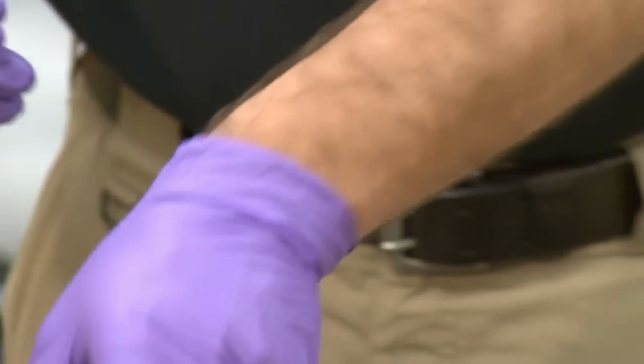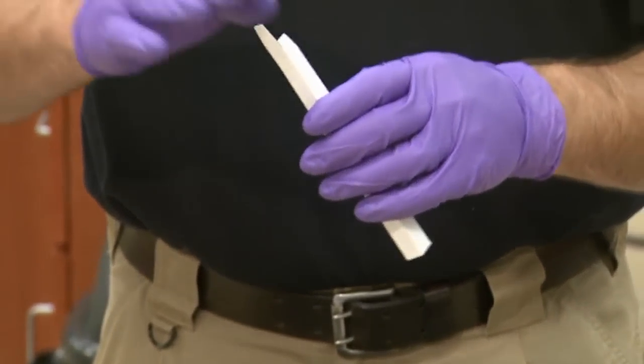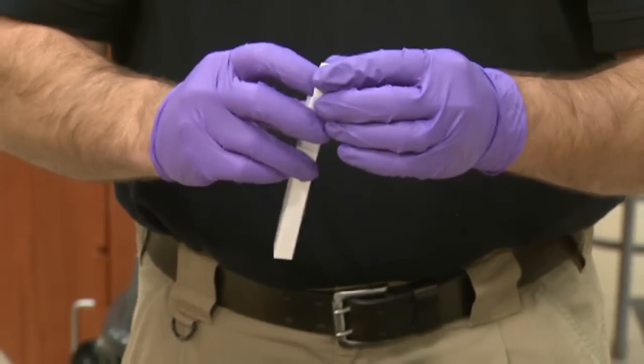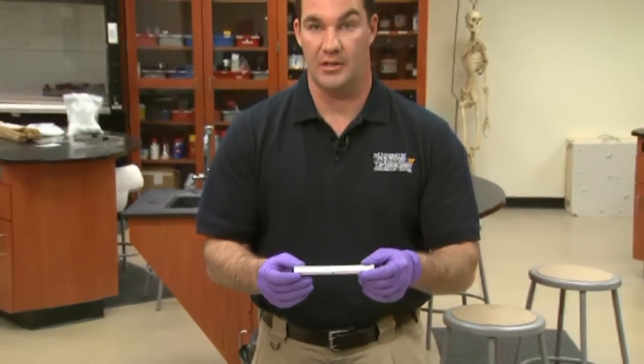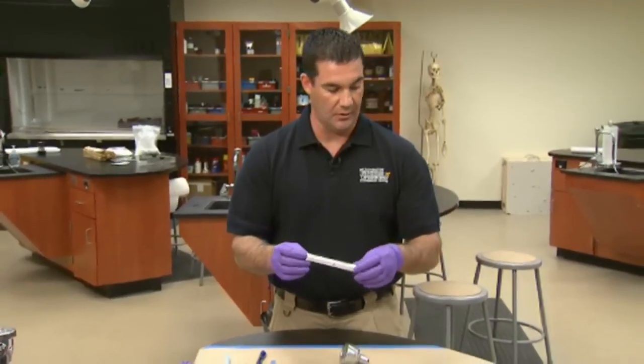Once that's done, you want to place it back into the swab container, close it, and package it into a separate paper packaging — either paper or envelope.